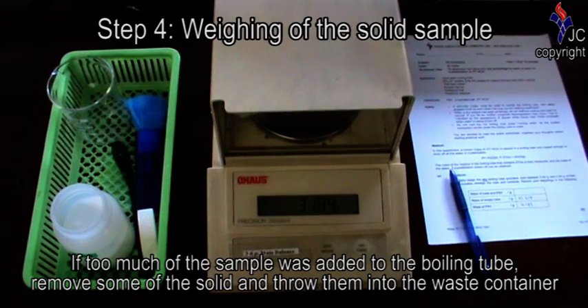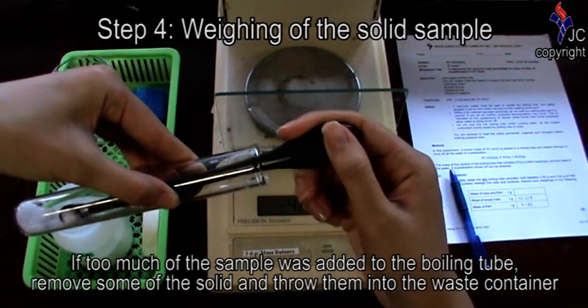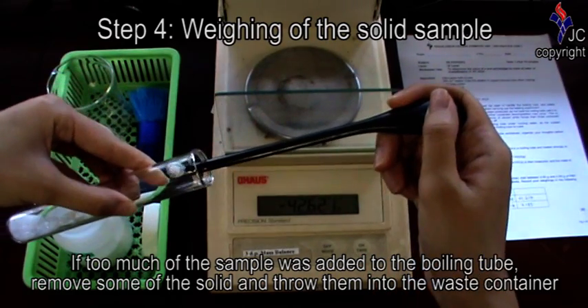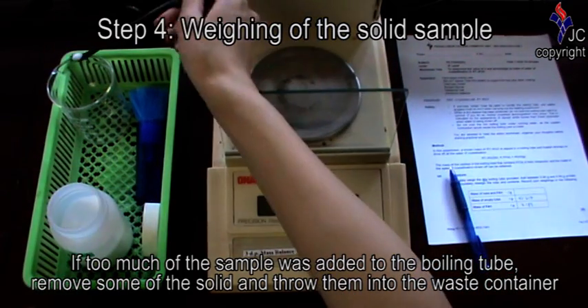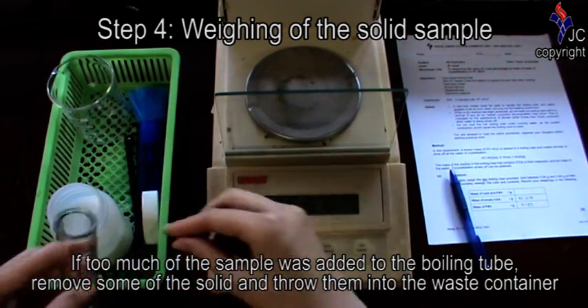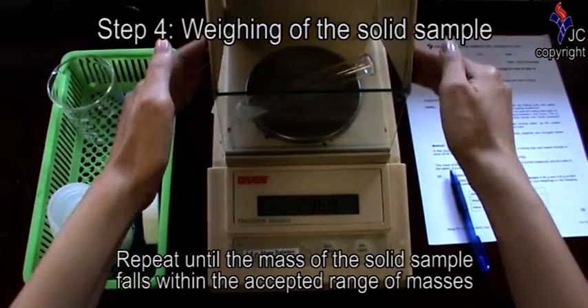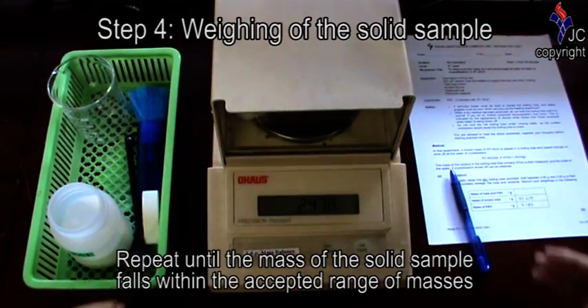Repeat until the mass of the solid sample falls within the accepted range of masses. However, if too much of the sample was added to the boiling tube, remove some of the solid and discard it into the waste container. Repeat until the mass falls within the accepted range.